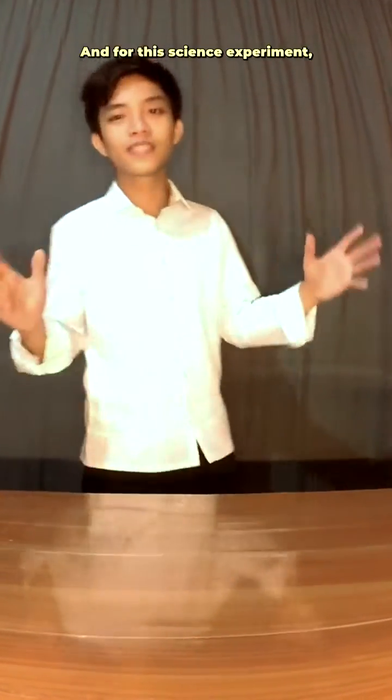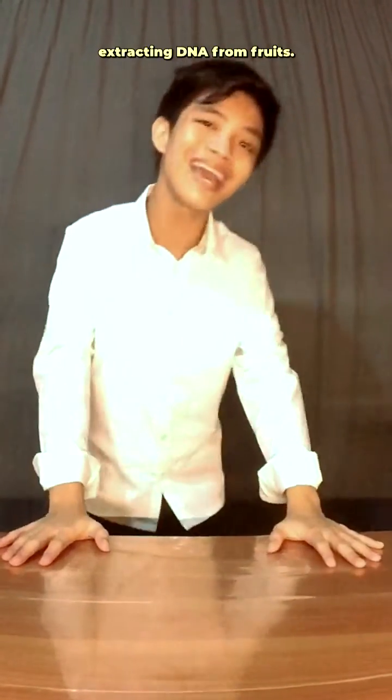Hi, my name is Joshua Balmeningo, and for this science experiment, we will take a look at extracting DNA from fruits. In this case, bananas.